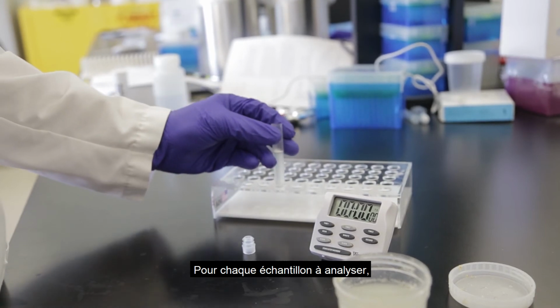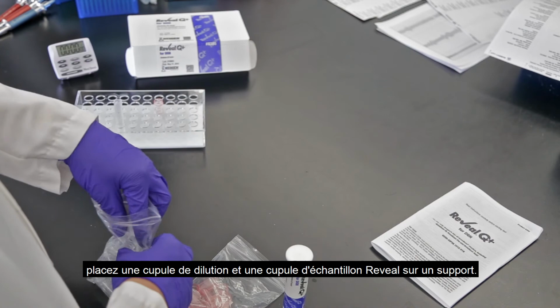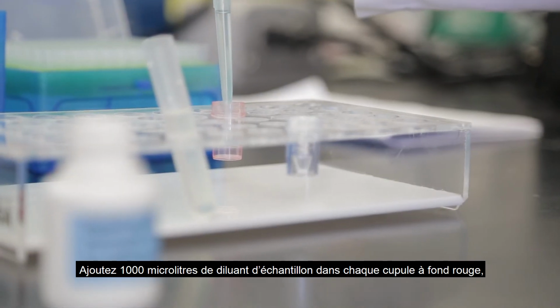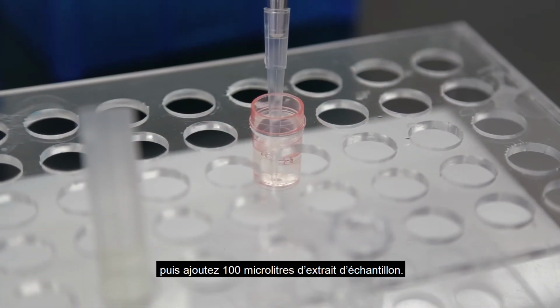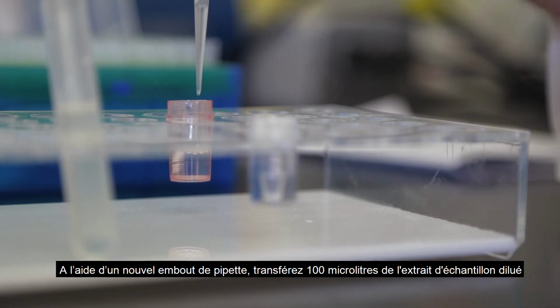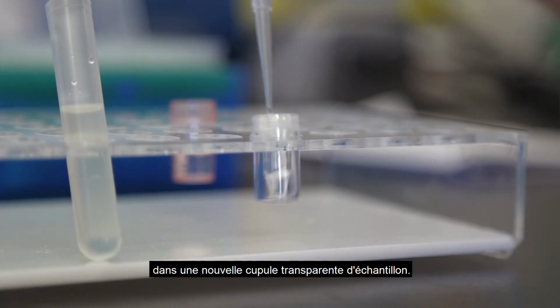For each sample you're testing, place sample dilution tubes and Reveal sample cups in a sample cup rack. Add 1,000 microliters of sample diluent into each red sample dilution cup. Then add 100 microliters of the sample extract. Mix up and down with the pipette at least 5 times. Transfer 100 microliters diluted extract to a Reveal sample cup. Use a new pipette tip for each sample.